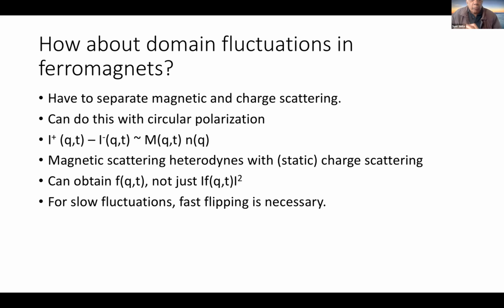We were not able to do this very easily at APS on that setup on sector 8, but we tried to compensate by going to small q, where the motion is supposed to slow down, and we could make the times large enough to measure them. But I think in general, one needs to go to some method of doing grazing-incidence XPCS at very fast times.